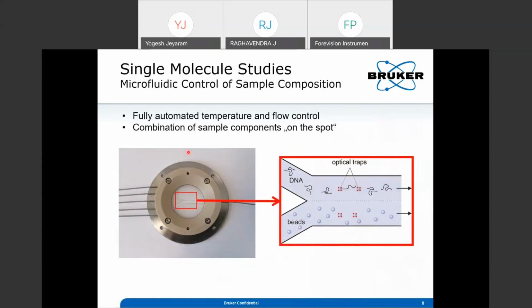If you do it in a conventional way, so you do it in your lab, there's a large chance of it getting agglomerated. The beads, maybe you get two, maybe you get many. It's all kind of a mismatch. So then you have to sort through it under your microscope to find statistically, well, some DNA has magically two beads out there, both ends. Then you pick that and do the studies.